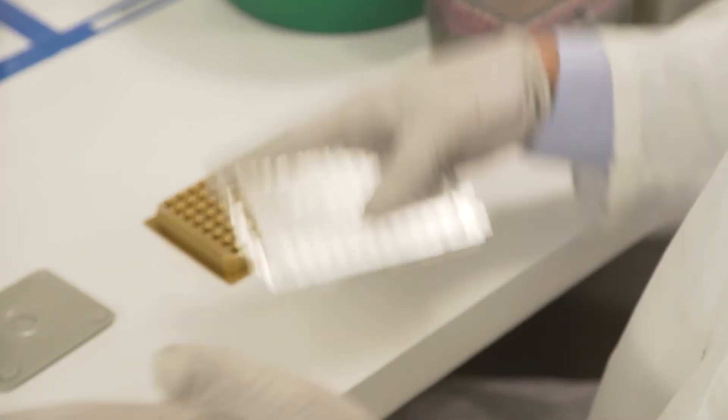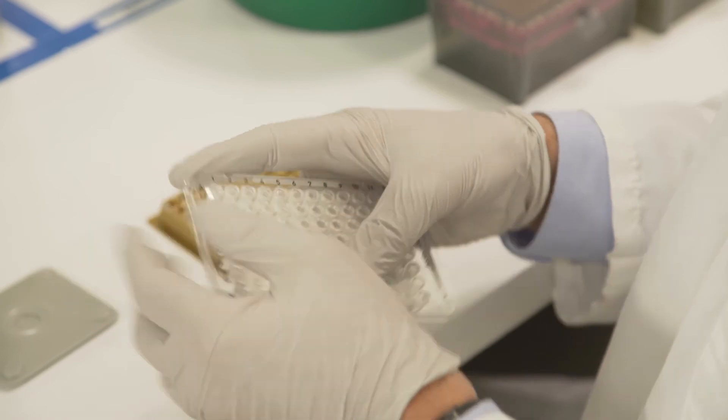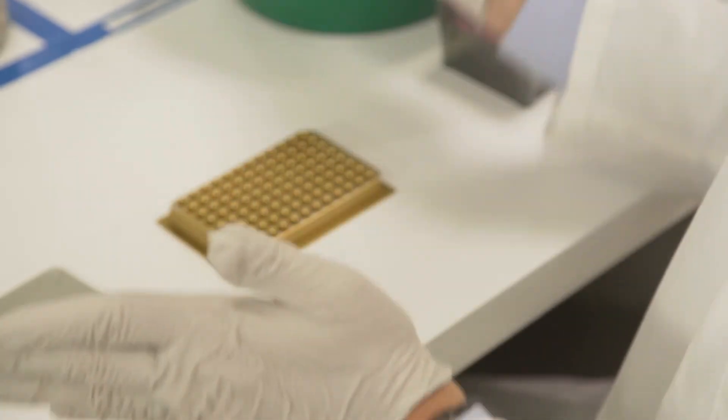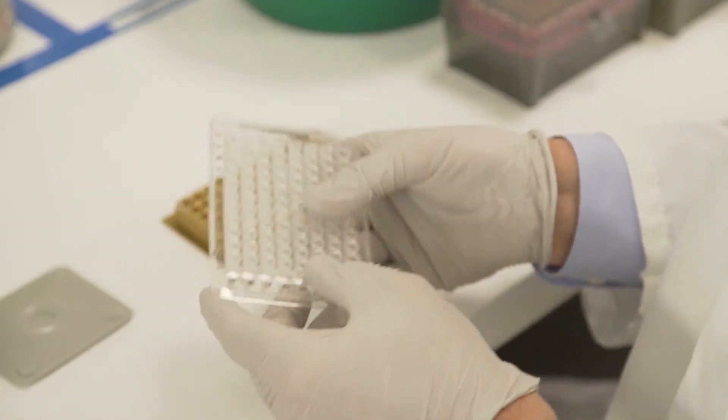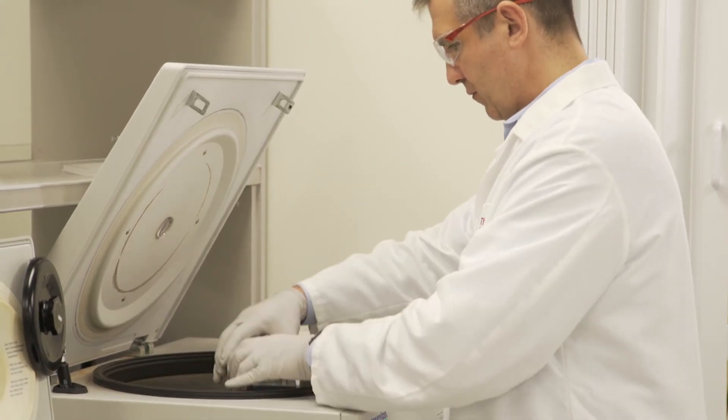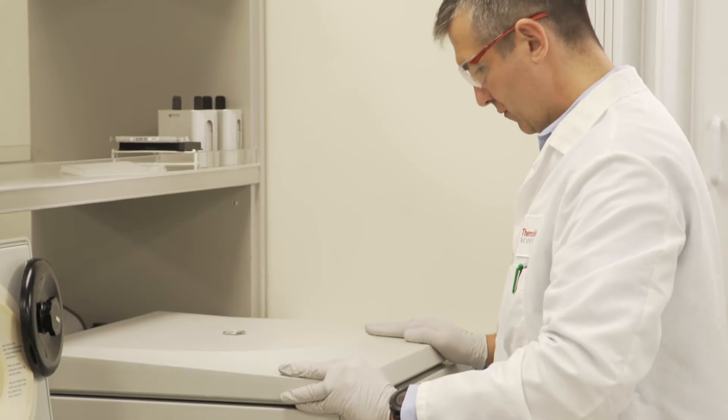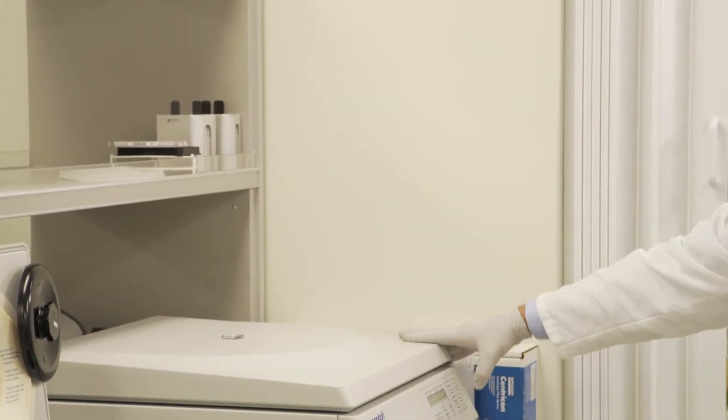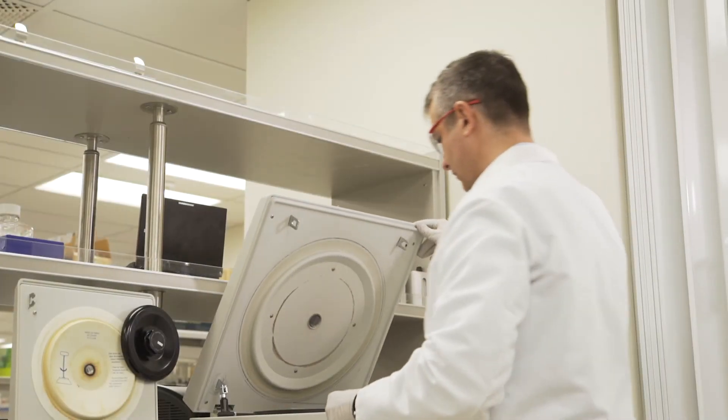Adequate mixing is critical and can be achieved by carefully pipetting up and down at each step or by striking the plate against your hand three times, rotating the plate, and striking it three times again. Then centrifuge the plate at 3,000 times g to ensure all the liquids are collected to the bottom of the wells and return the plate to the cold block.